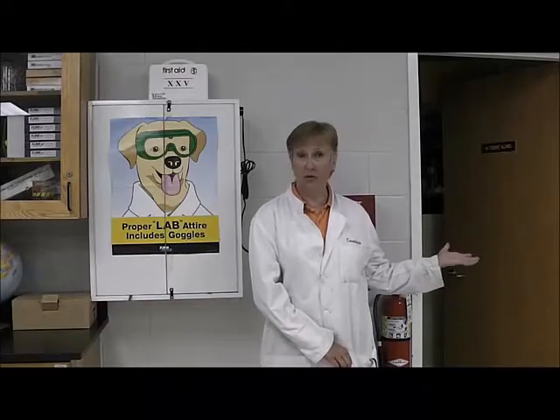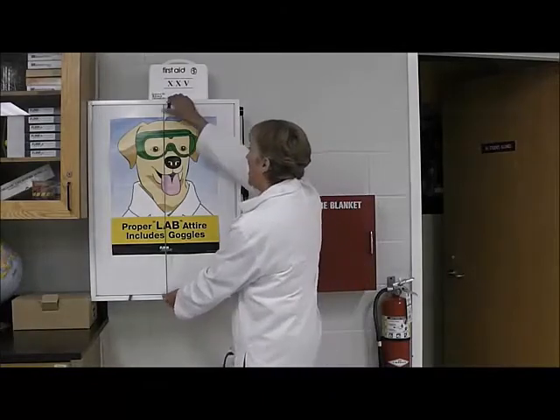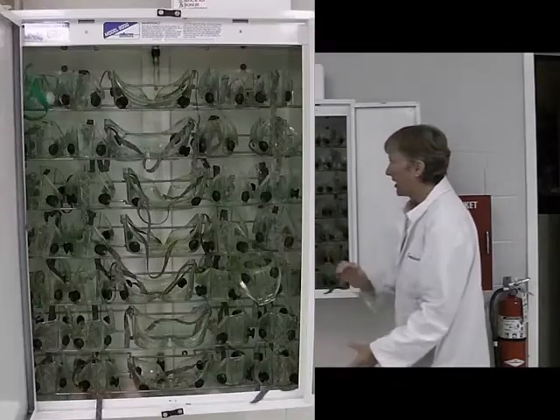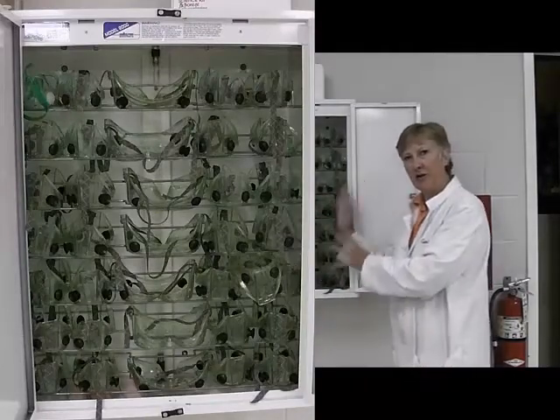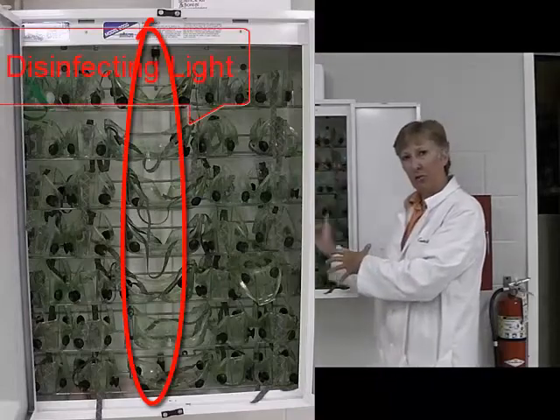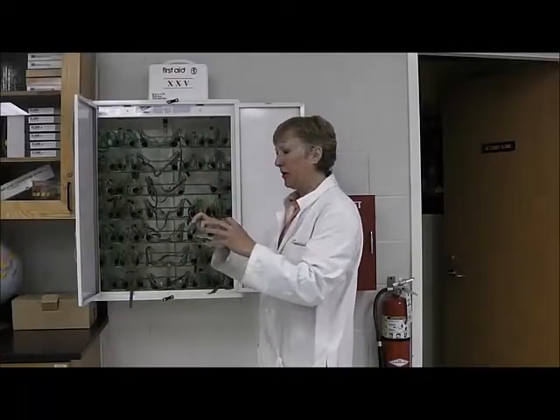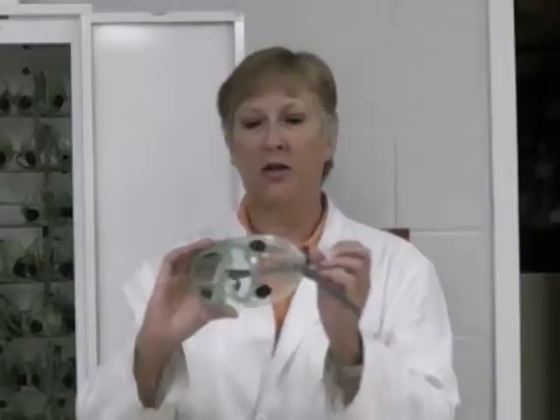Next to me here is our goggle cabinet. It is in our rooms in the science hallway, right next to the storeroom, which students cannot go through, but every goggle cabinet is right next to the storeroom — really hard to miss. You will notice that the goggles are beautifully arranged in very neat rows. We would like to see it that way before and after the lab. In order to be disinfected appropriately, they have to be in these rows and not just thrown in helter-skelter. You will get a pair of goggles, usually for your lab table, your group. They are splash goggles — they have nice sides so that chemicals cannot splash under, like plain old safety glasses.